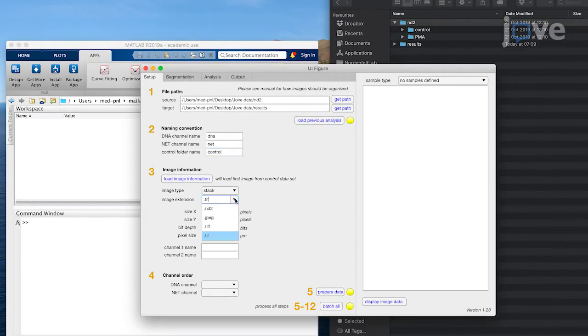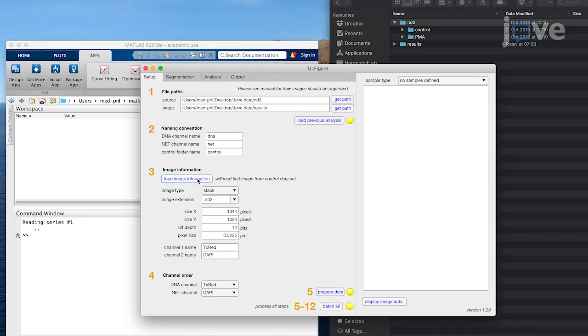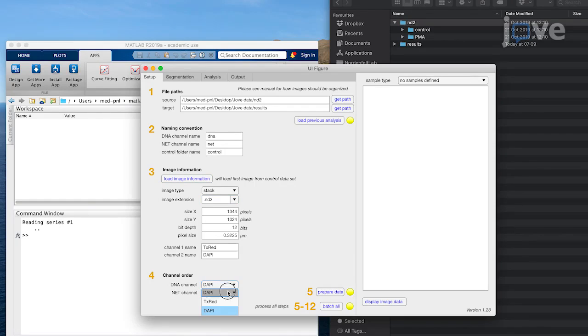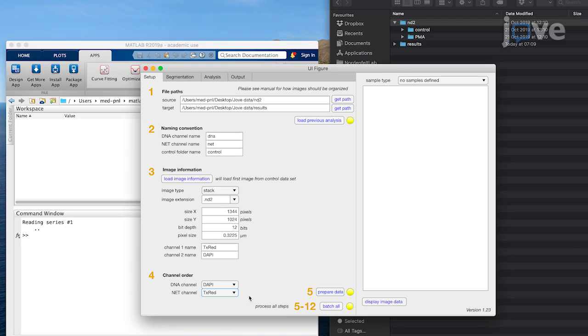Click the Load Image Information button and load the image metadata into the software. Then, in the Channel Order submenu, select the correct channel order contained in the images. This helps to prevent accidental mismatches.